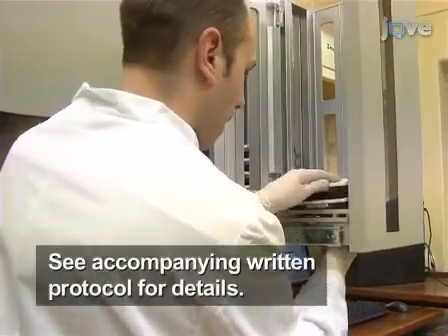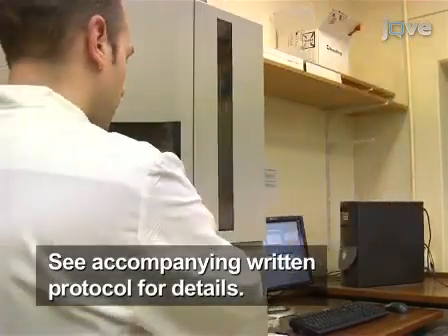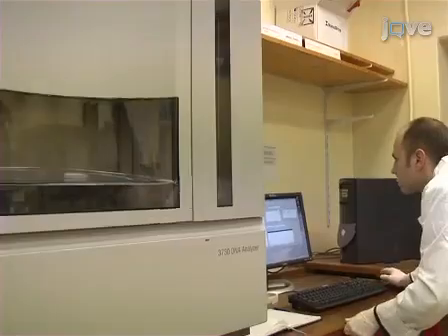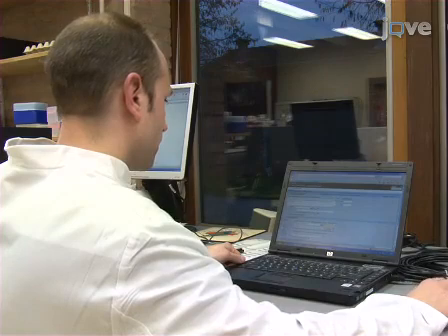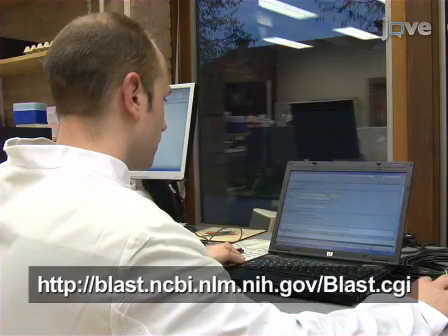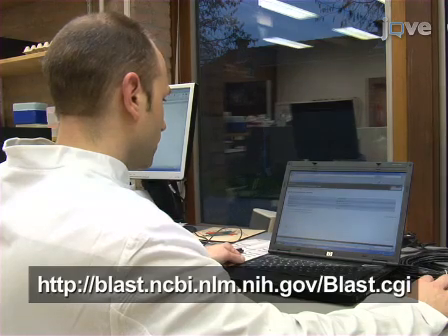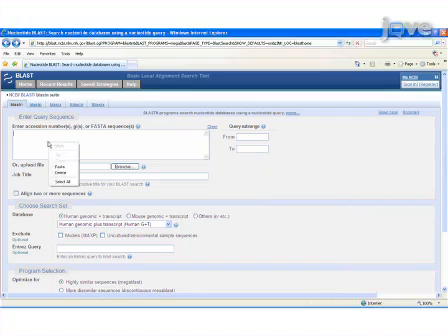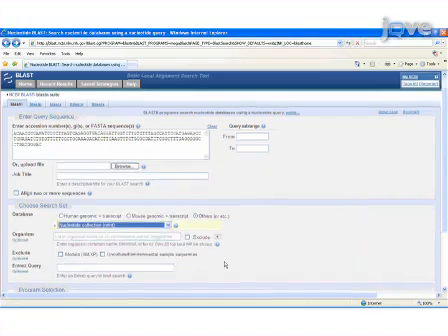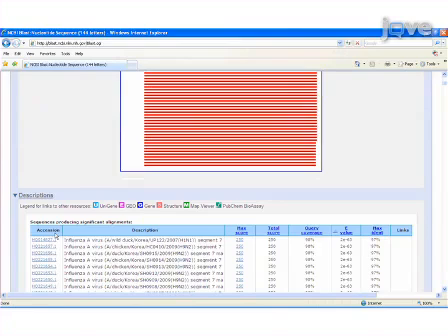Carry out Sanger sequencing of the target fragments. Here, the forward primer M52C is used to sequence the AIV matrix gene. Once the sequencing results have been obtained, compare the cDNA sequences against nucleotide databases such as GenBank using local or web-based tools such as BLAST at the National Center for Biotechnology Information. Gene fragment sequences can be matched to existing entries. Thus, the specific AIV strain can be characterized and valuable information on sequence features obtained.